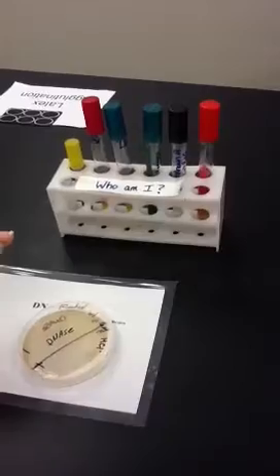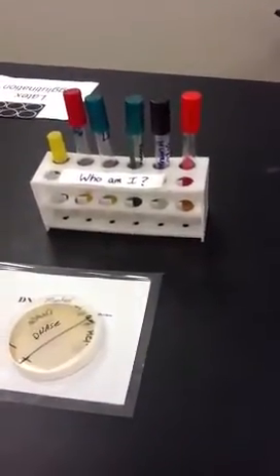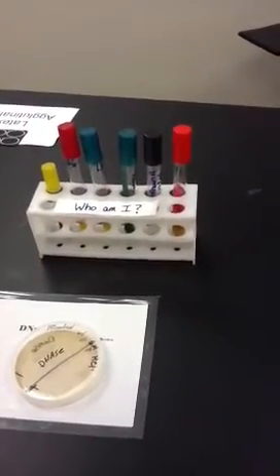Basically, most of these plates, if it clears, it's positive. This one, that one, that one. Casein test? Casein, if it clears, it's positive for casein. Who am I? Casease.